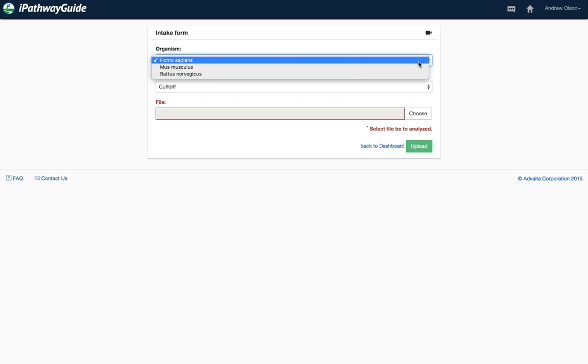One thing that one of our customers does is use homologs and do the translation to homologs. I think that's the best way, and I know that there are other applications out there that suggest doing the same thing. We've talked about incorporating a homolog translator in the future, but there's a lot of other requests that seem to have a little bit of higher priority right now. But hey, the more you ask for it, the more likely you are to get it.